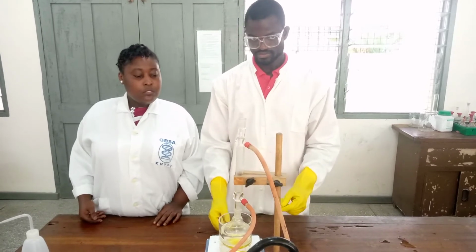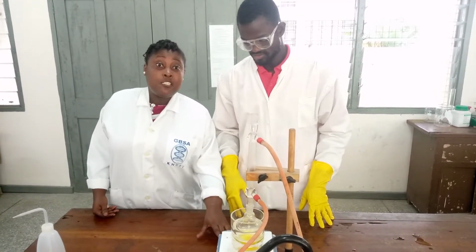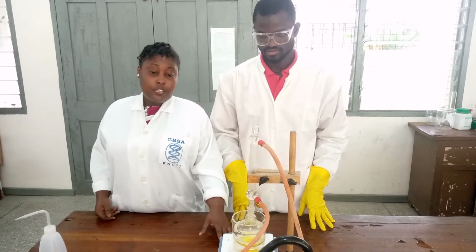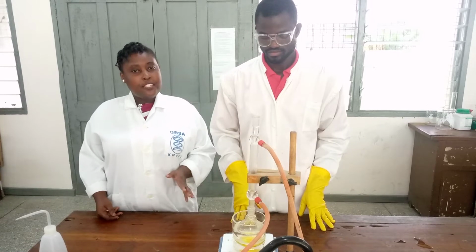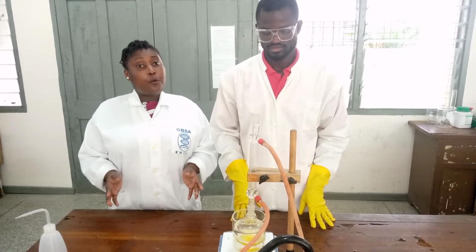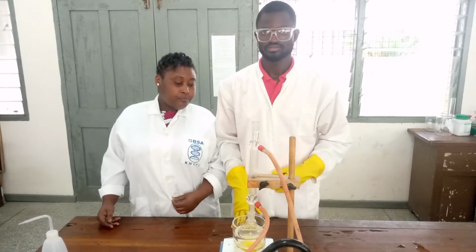Alright, so if you don't have a hot plate, like we are using, you can use a heating mantle. Anything that can provide heat, you can use that, okay? So we have to wait patiently for about 7 to 8 minutes for the reaction to be complete. Then we come back and we continue from there, okay?